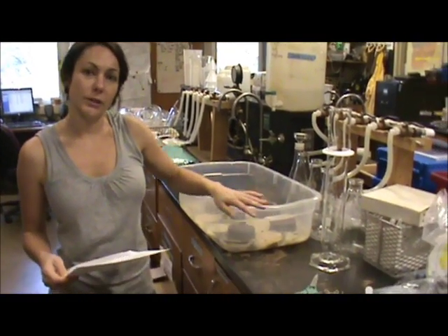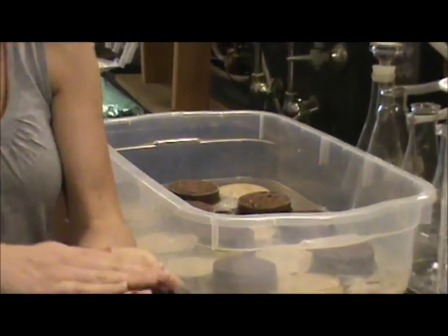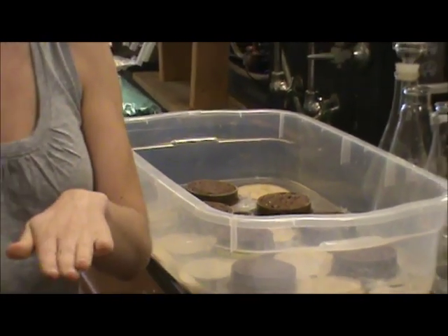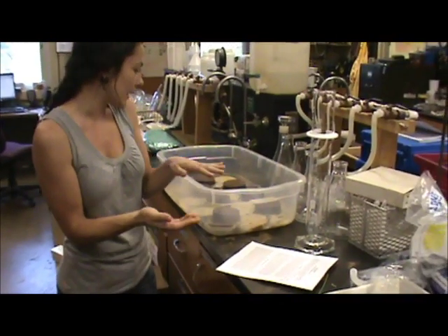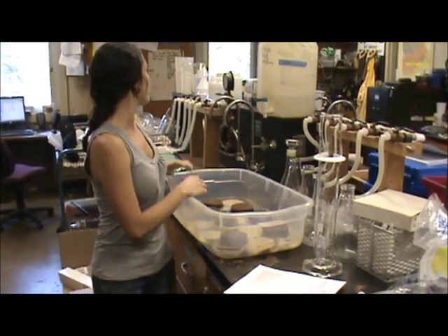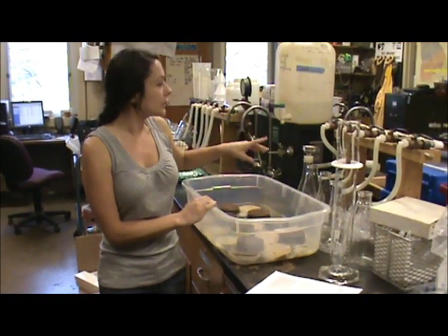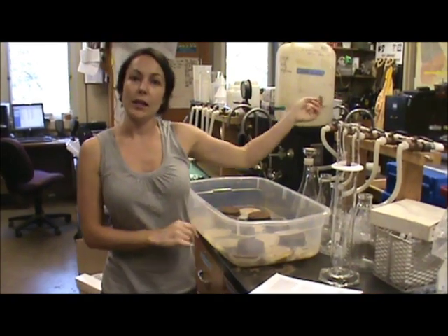What we did is we took one of the soil samples that you guys took out in the rain garden, and we shaved off the tops and the bottom of the rings to make sure that the soil was level. We soaked them overnight in 0.01 molar calcium chloride solution. We let them saturate, and then we're going to set them up on a Tempe cell, and over the next six weeks we'll be taking pressure readings and recording the difference in the weights of the Tempe cells.